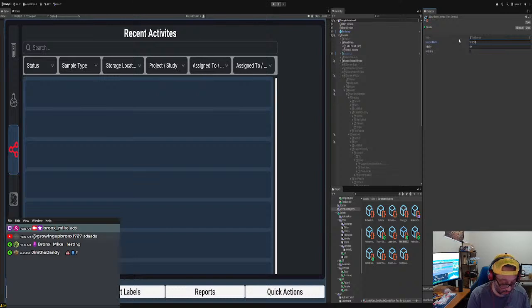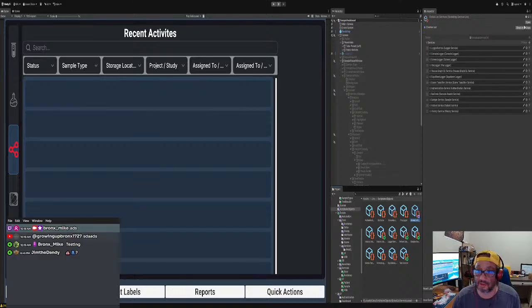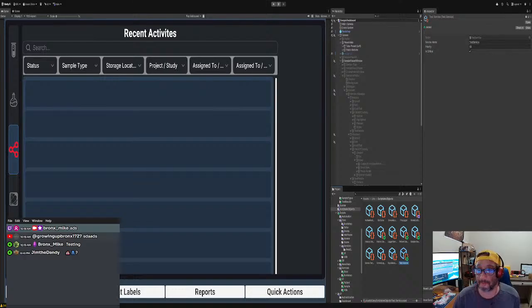Test service. But we'll go through service, and it's kind of critical. Okay, so we made the test service, right? All right, and then we got our global list right here, and then we just add it to this global list. Test service. There we go. It's there. Okay, so now let's look at the code for the test service, right?